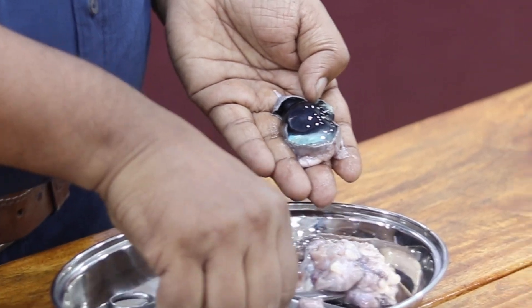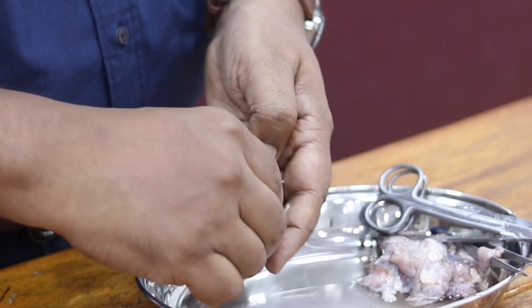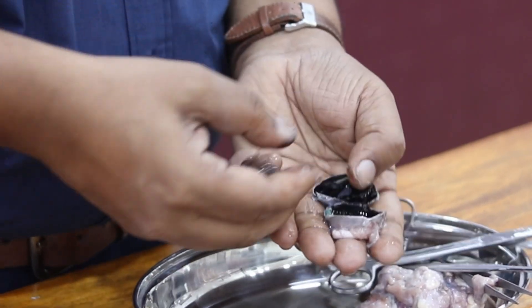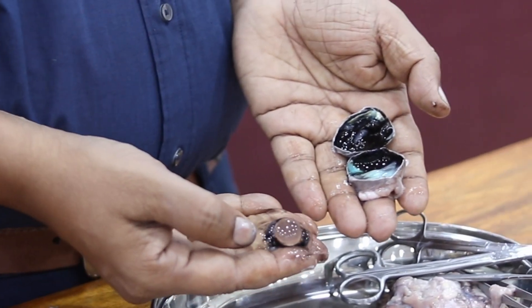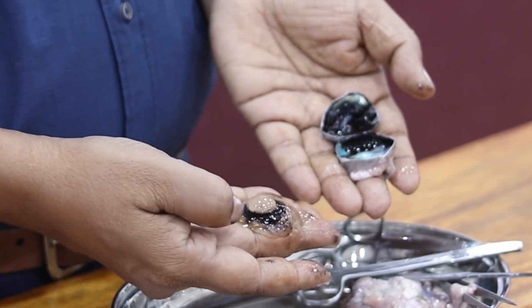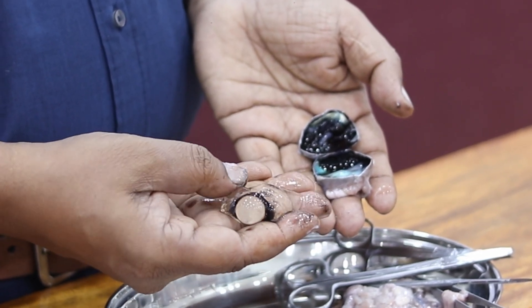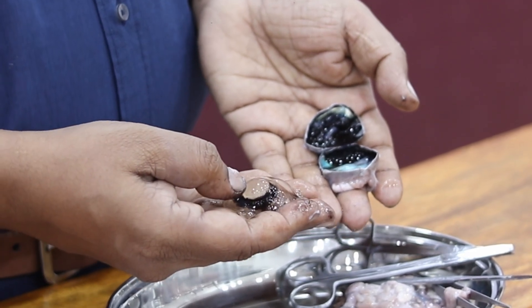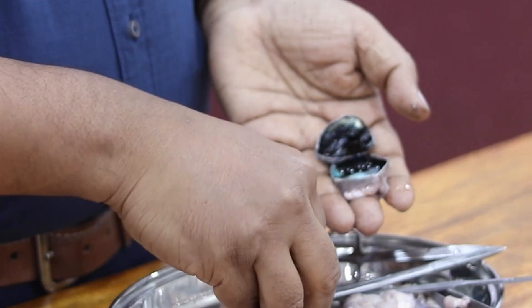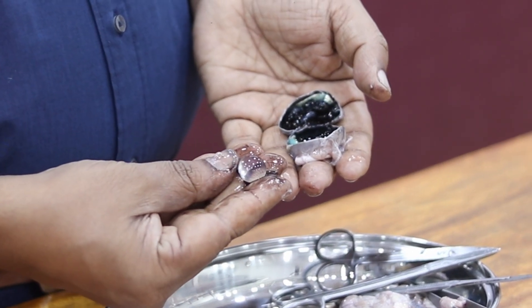I'm going to take the vitreous body out and show you the lens. Look at this — this is the lens, and you can see some of the iris pigments present around the lens. This jelly-like material is the vitreous body. We can separate the lens — let me show you the lens after separation. This one is the lens, and it has a lens capsule.